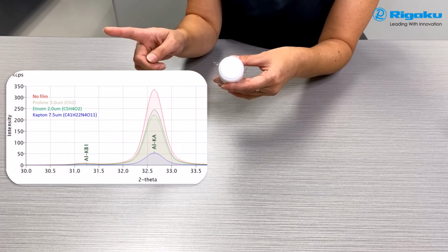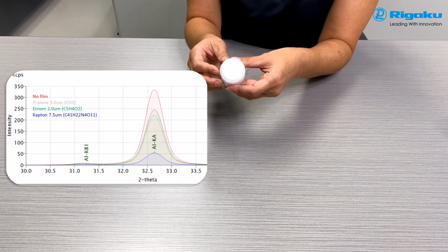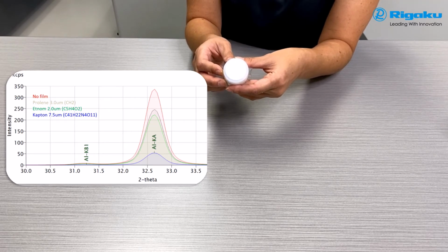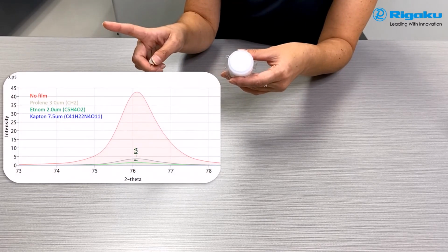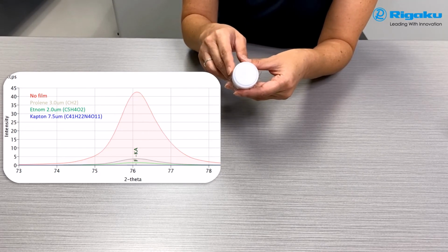Now our next example, as you see here, is aluminum, where it does get affected by the type of film and the thickness that you're using. Right, and you can see in there that Kapton leaves probably only about 20% of the signal because that's a thicker, heavier film. Exactly. Now the most drastic one would be fluorine, or you can see carbon here, obviously. But yeah, the fluorine, the film will be attenuating that signal quite a bit.